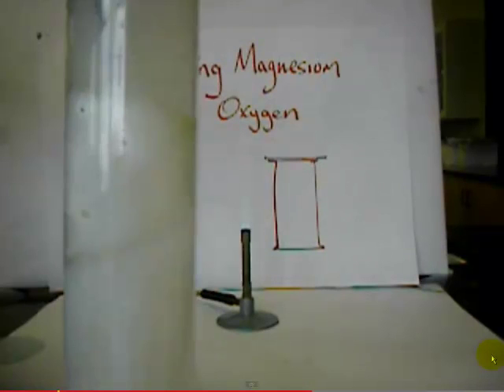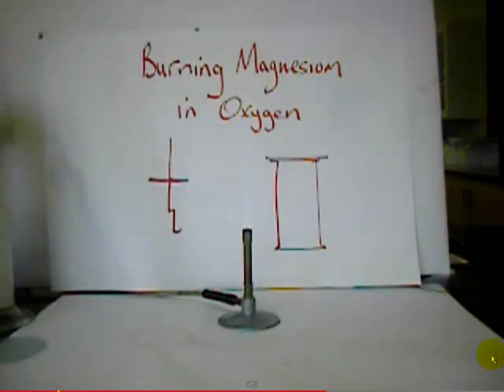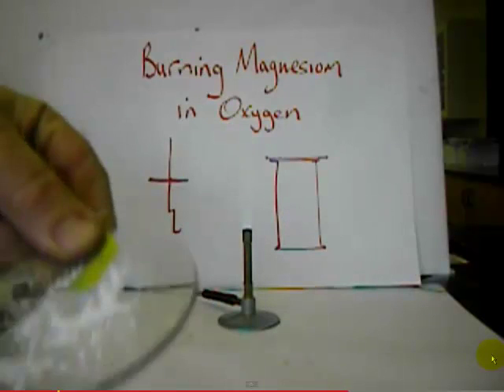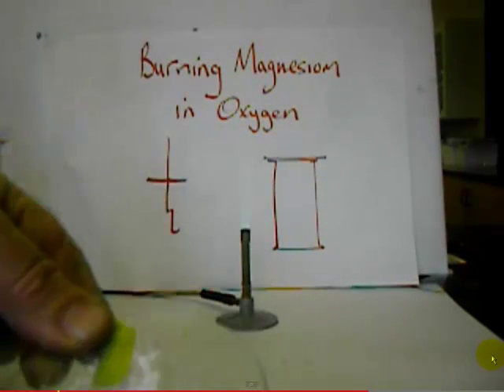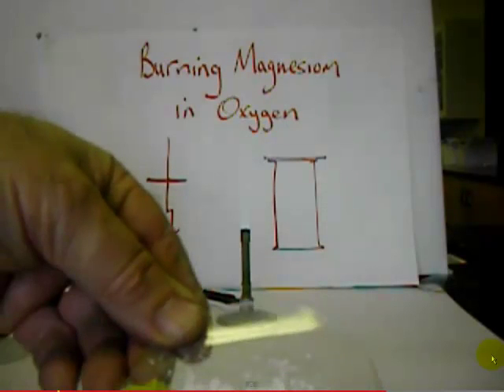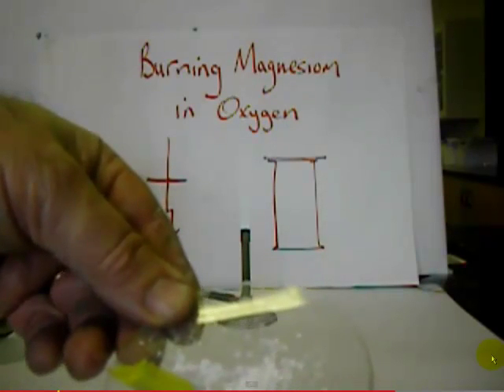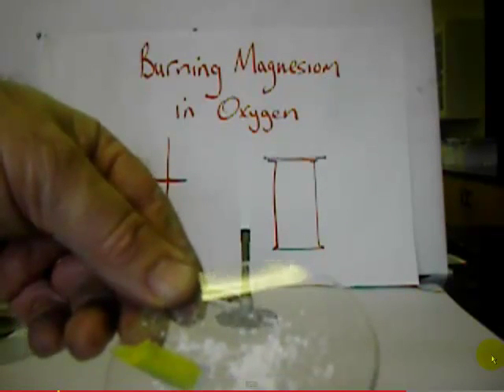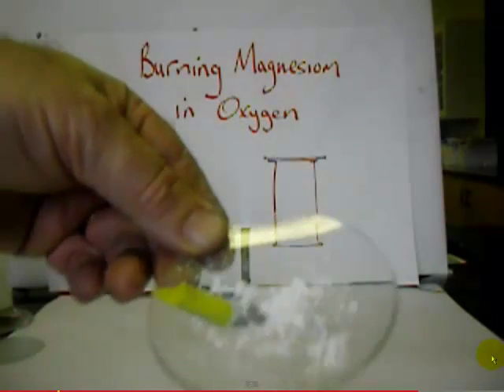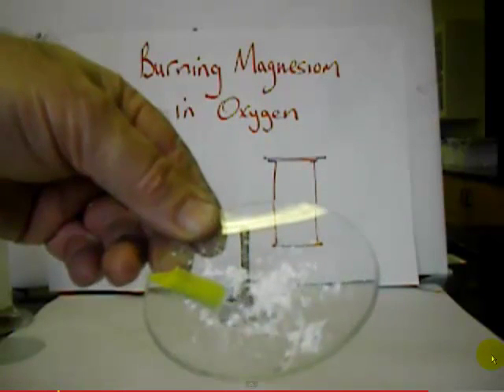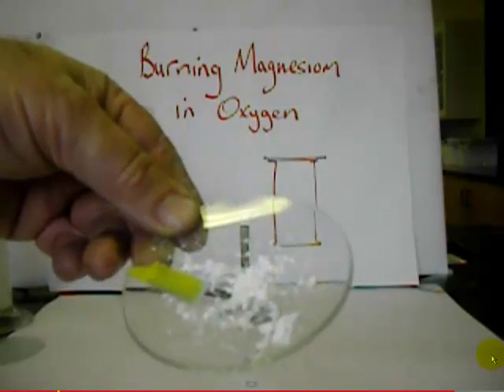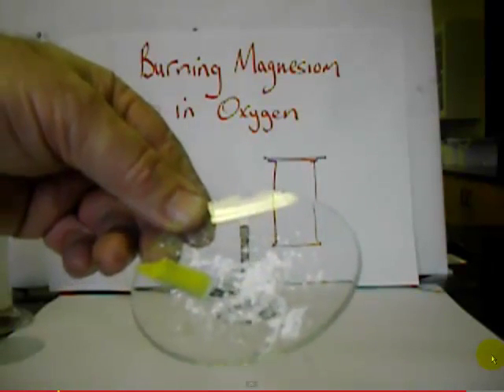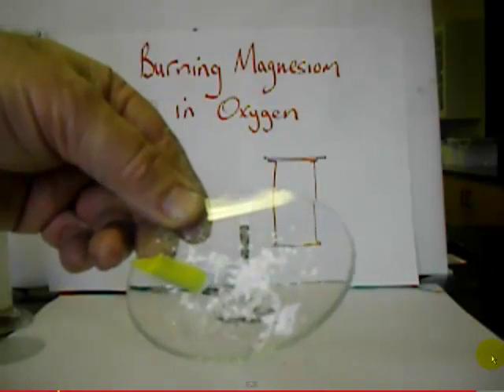I can test the pH of the resulting oxide. I've collected some of the oxide on a watch glass and placed damp universal indicator paper in contact with the white powder. I see it turning from a golden yellow colour to a greeny-blue colour, indicating that magnesium oxide is very weakly alkaline. Magnesium oxide is only sparingly soluble in water, dissolving slightly to form a weakly alkaline solution.